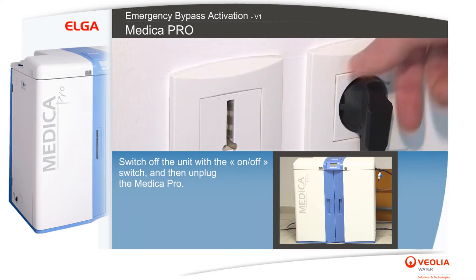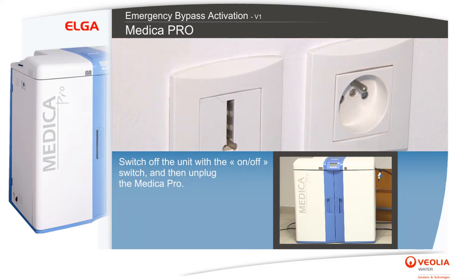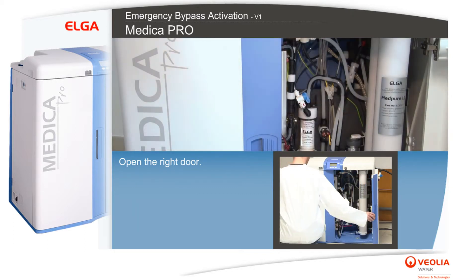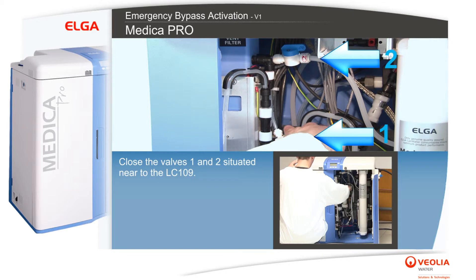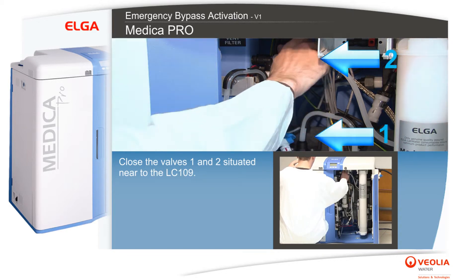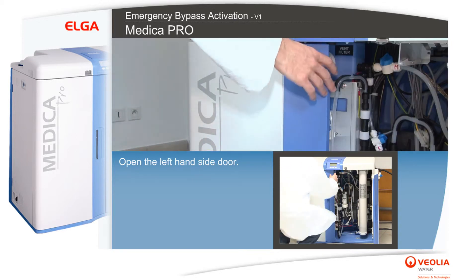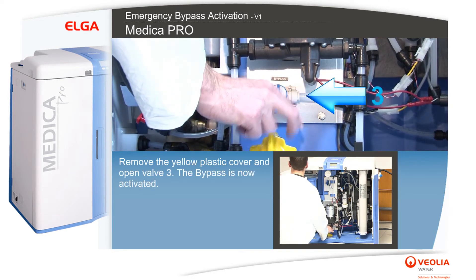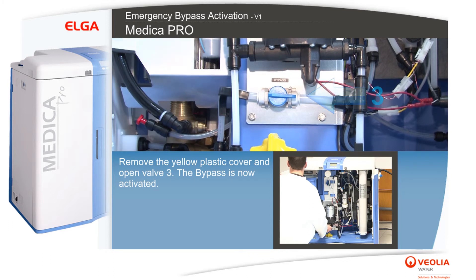Switch off the unit with the on/off switch and then unplug the Medica Pro. Open the right-hand side door and close valves 1 and 2 situated near the LC 109.